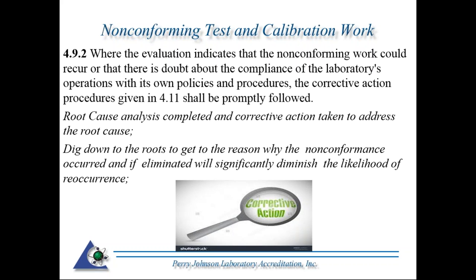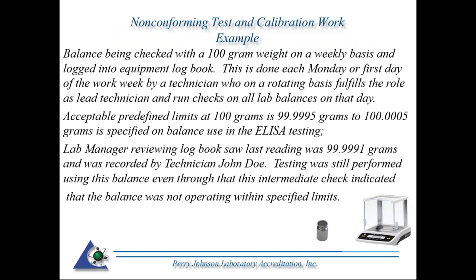So that is it as far as the requirements within section 4.9 of 17025. I've got an example here that we're going to walk through. It's a simplified example, but I think it looks at all the requirements we went through and hopefully sheds some clarification if there are any questions out there concerning the requirements that we just went through.